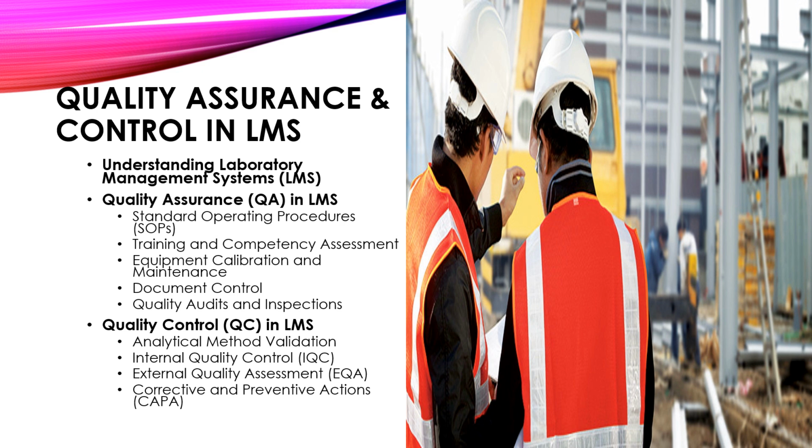External quality assessment. Participation in proficiency testing programs administered by external organizations to assess laboratory performance relative to other laboratories is very important. External quality assessment provides an independent evaluation of analytical accuracy and identifies opportunities for improvement.